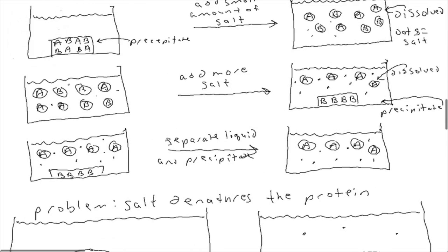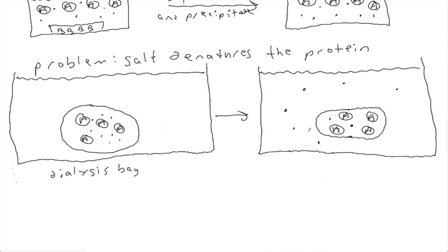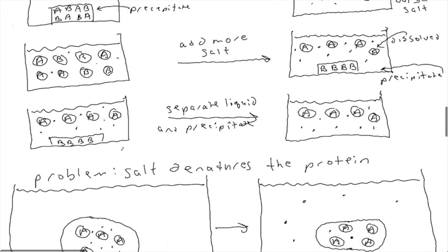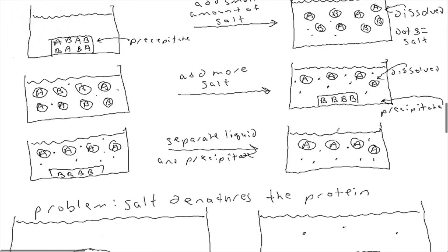Okay, so do you see how there was some confusion at what you were originally thinking about for salting out? When you were originally thinking about the salting out, you were just focusing on the dialysis portion, not really the salting out portion. Notice that the actual salting out doesn't even involve dialysis, would you agree? You see what I'm saying? The salting out process itself doesn't involve dialysis. Yes. The dialysis is just to get rid of the salt afterwards.